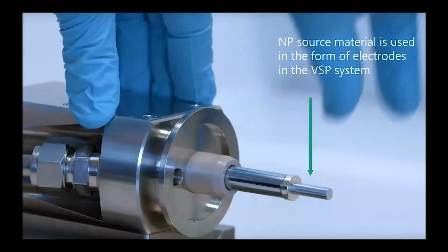Here you see an image of an electrode mounted in our system. So I will now hand over to the virtual lab to Koosje, where she will demonstrate how easy it is to install the electrodes and change the material.